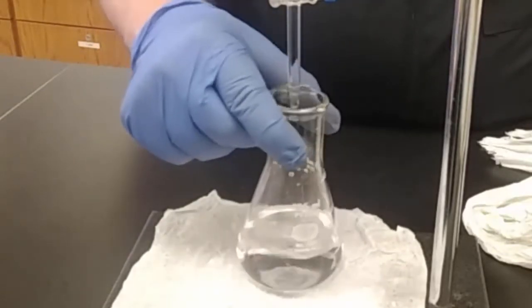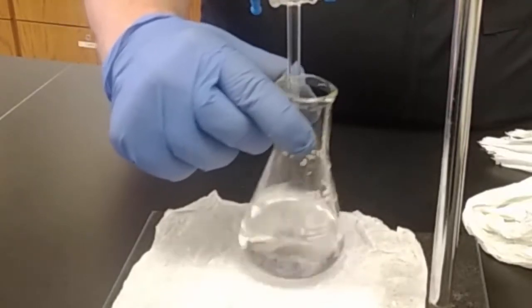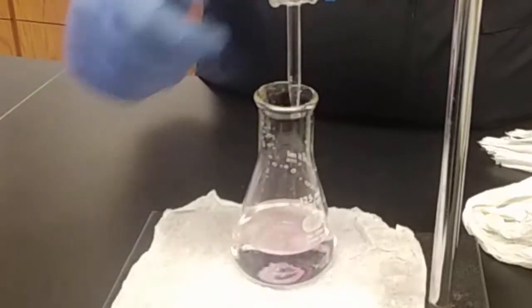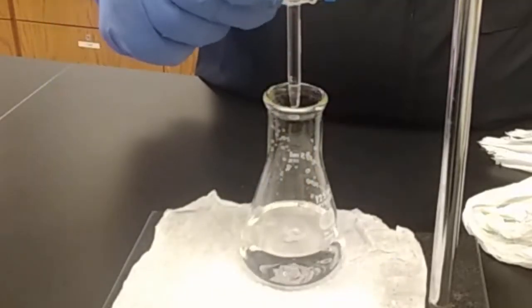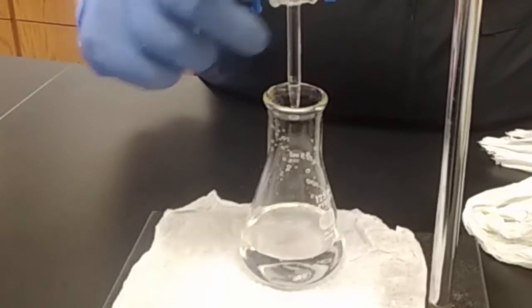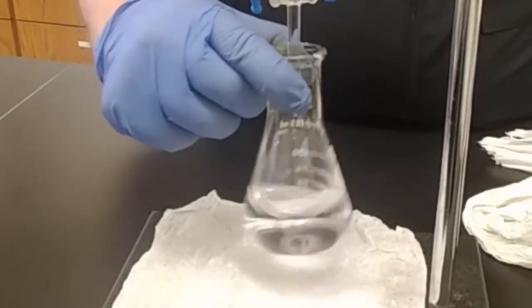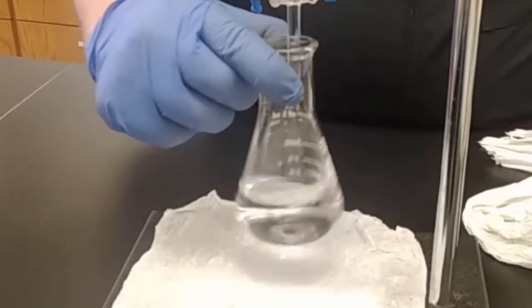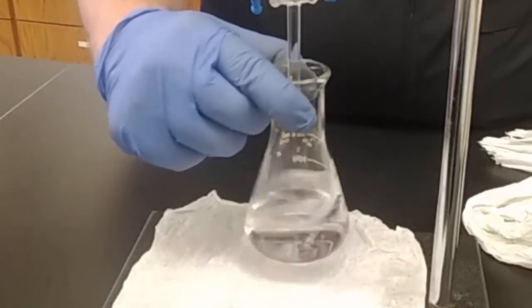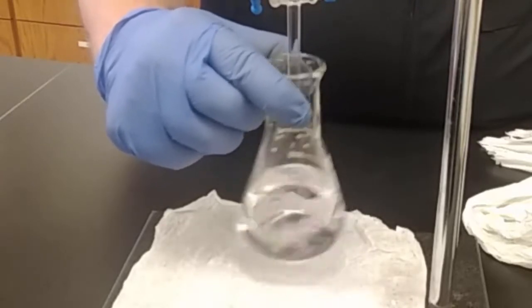Maybe it's gonna stay. Nope. Use a flask also instead of a beaker so that it doesn't splash and escape. I'll give you an extra close-up on the next one. Just wanted you to see all the action on this first one. Staying pink a little longer, at least locally where the drop is hitting, but it's not staying permanently.